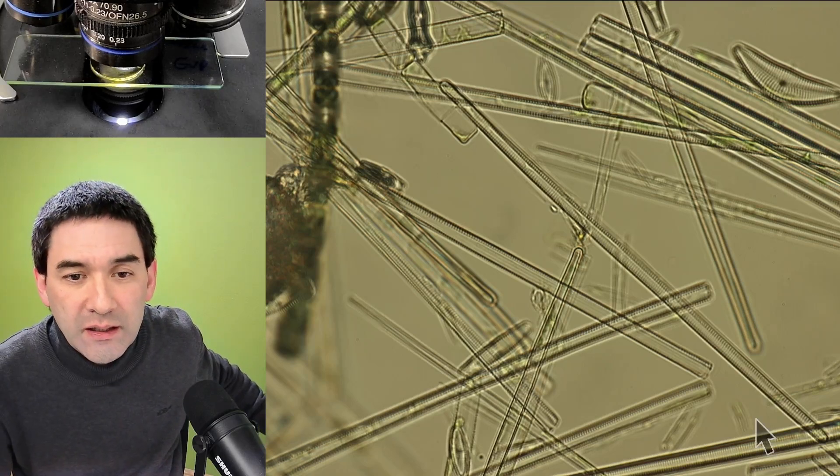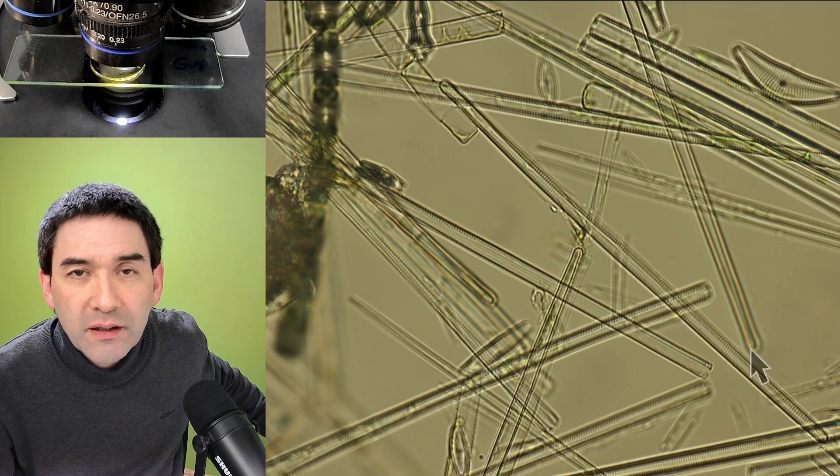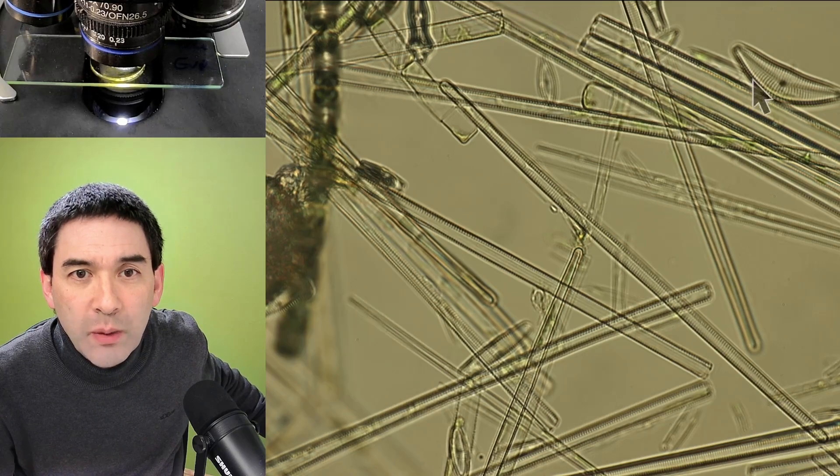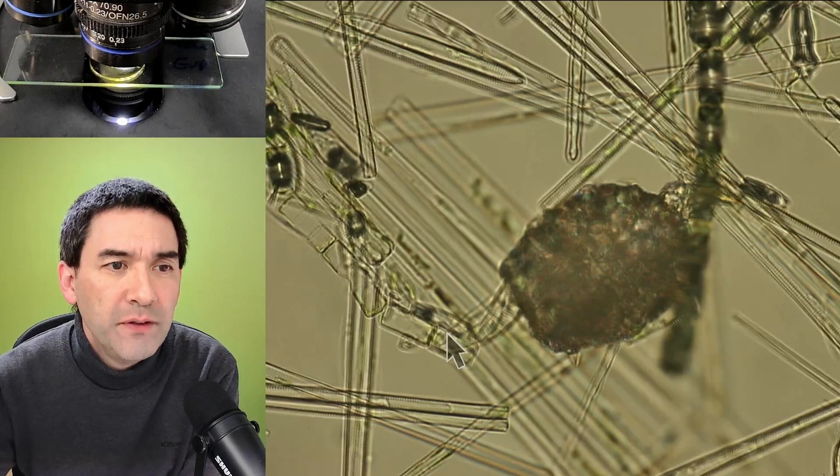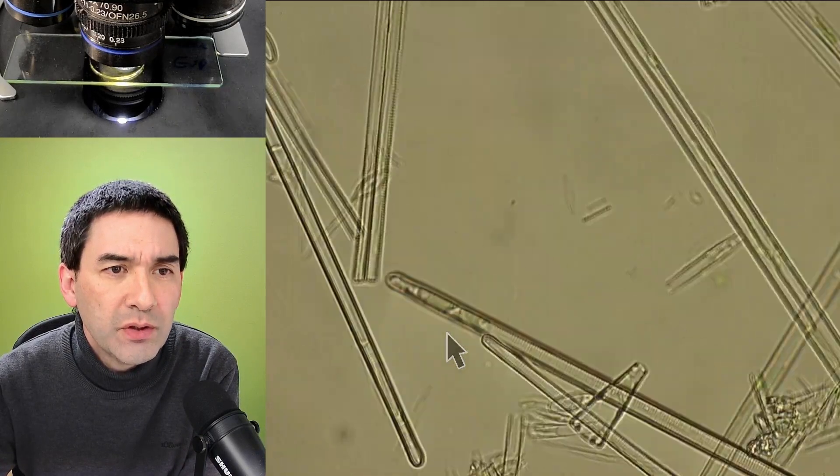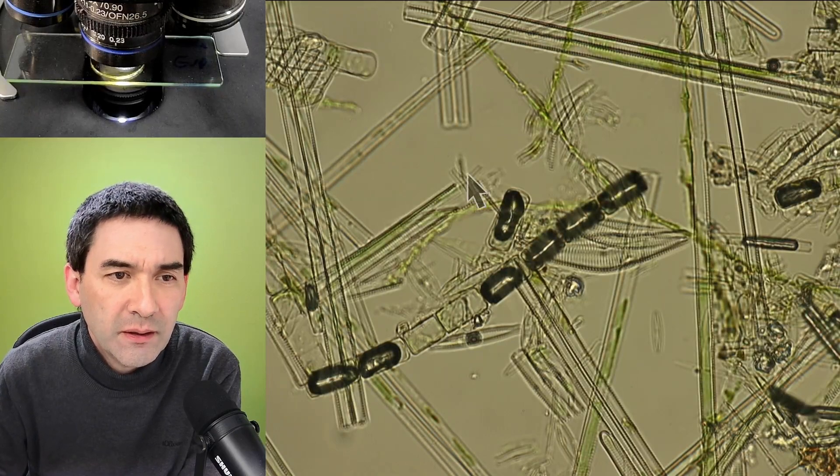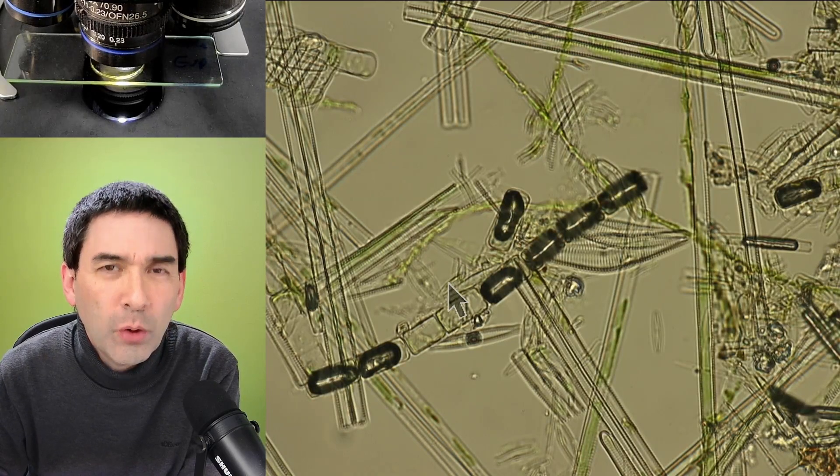You see that the diatom shells look quite empty now. I mean, there are a couple that I've seen where the chloroplasts, the green chloroplasts, are still visible, up here a little bit more green. But no comparison to the other slide which I mounted in glycerin gelatin.